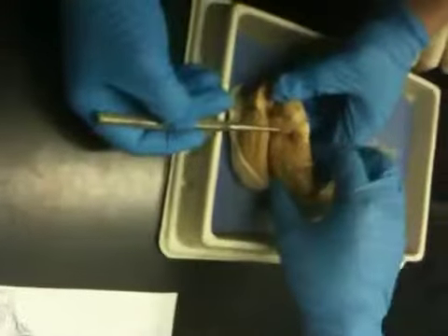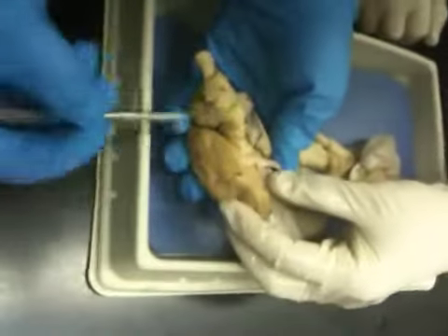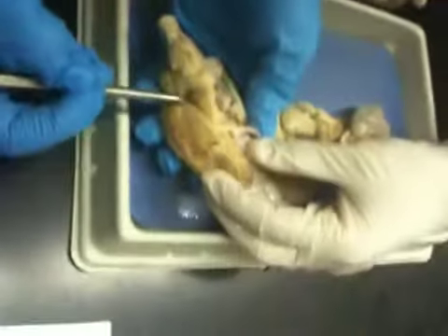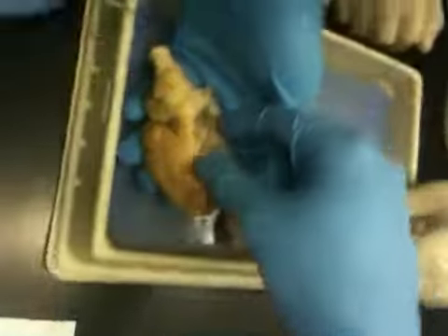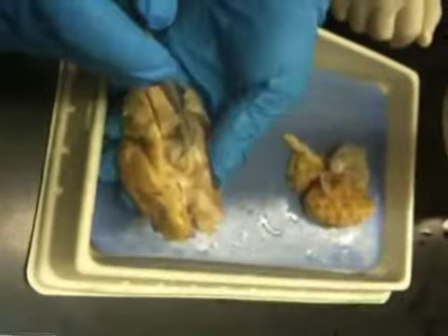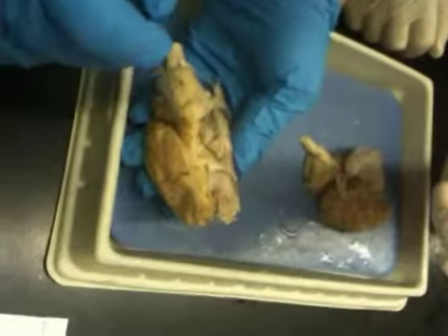You can see it from the ventral side. Where's the trigeminal? Flip it over. This is ventral. It would be right before this part, this lobe here. So technically it would come out right here. Yeah, right around here. Maybe this was it actually. Maybe it's attached to it. You'd have to cut off, but maybe this could be too. But technically speaking, it should come out here. That's everything. Alright, it wasn't that bad, I guess.